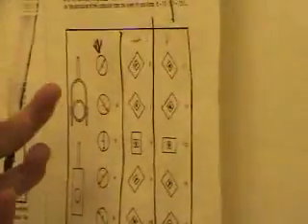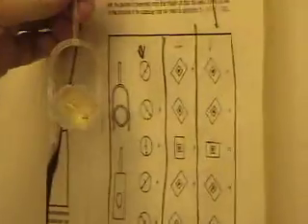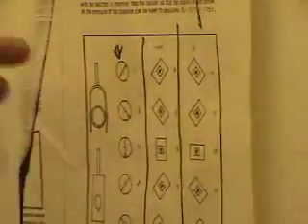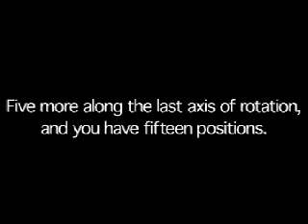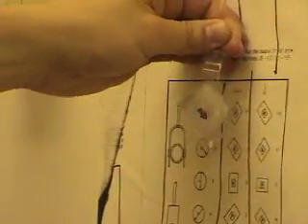So this first column corresponds to the single line. And so position 1 is going to be with this first dot right there. And then position 2, then we rotate the arrow like so, down like that. So that goes for the first 5 positions. Do 15 of those for each sample, and it goes over and over again.